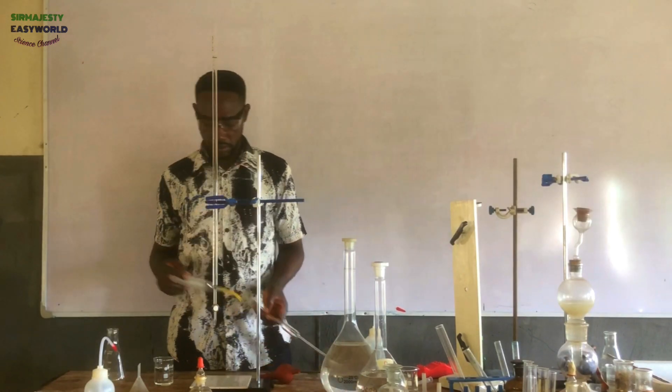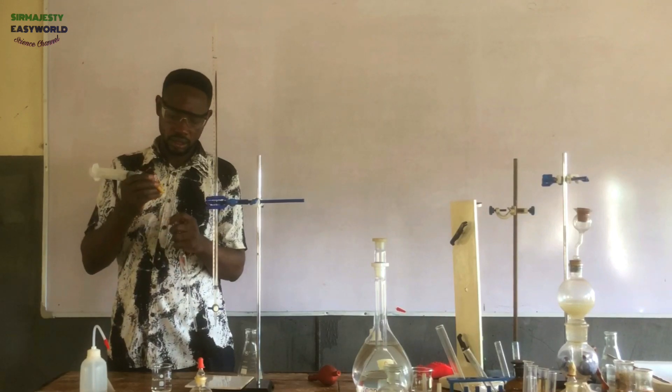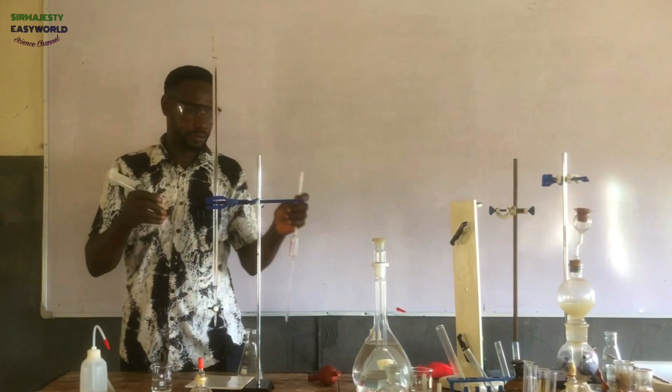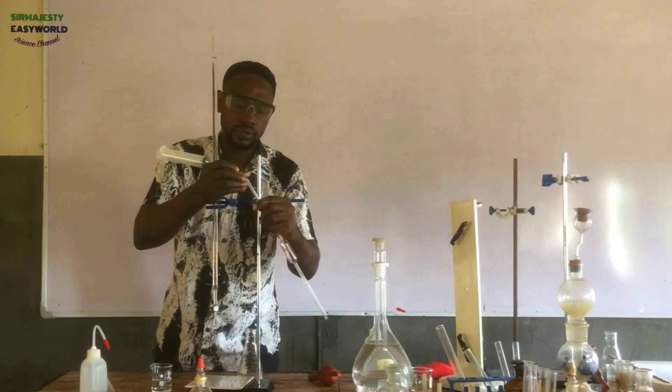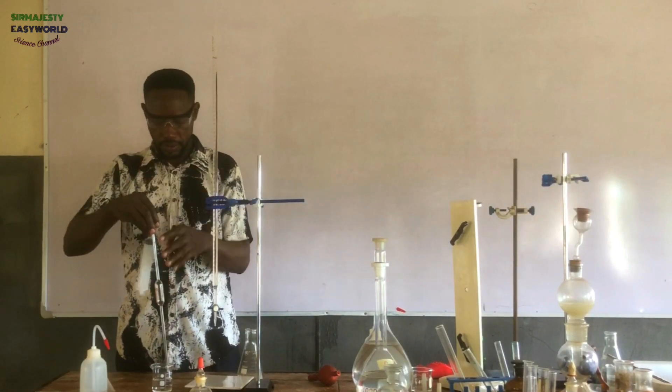So what you need to do — I'm carrying out the first titration here. I advise an amazing way of pipetting the base using the pipette. When you don't have money to buy the pipette bulb or pipette pump, you can use this syringe.